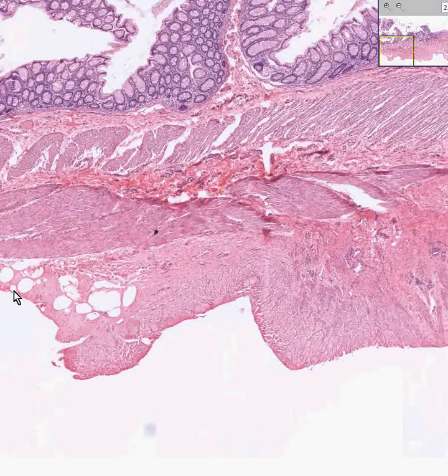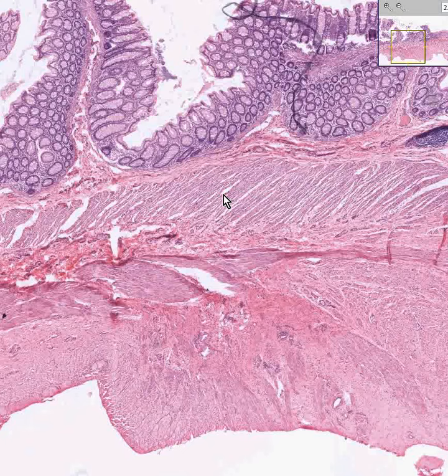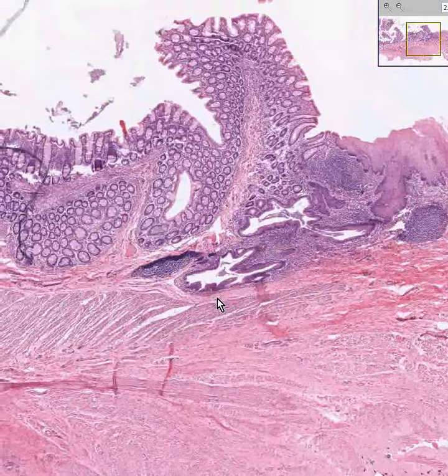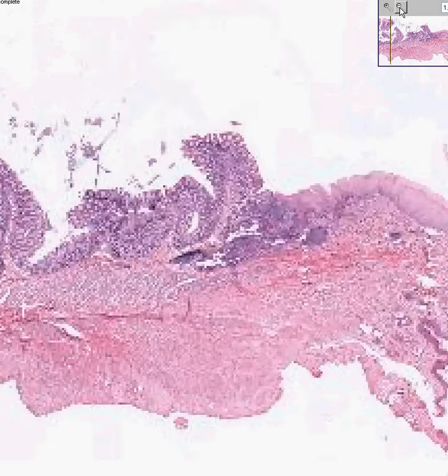I think when you're down at this level, you can say that this connective tissue here is adventitia because there is no peritoneum near the squamocolumnar junction. The squamocolumnar junction is also extremely important embryologically because it has a whole different set of arteries, veins, nerves, and everything. It's basically a collision between the gastrointestinal tract and the outer ectoderm.